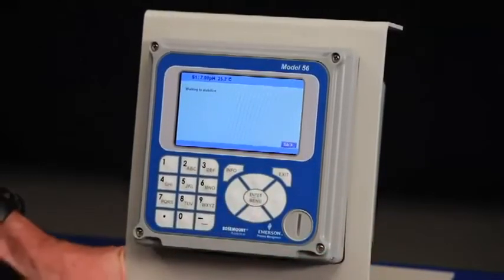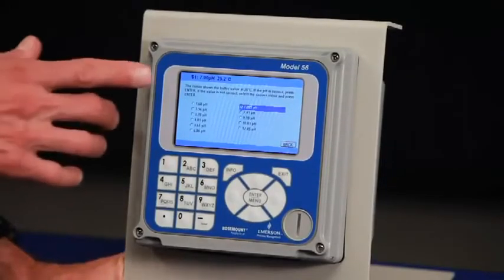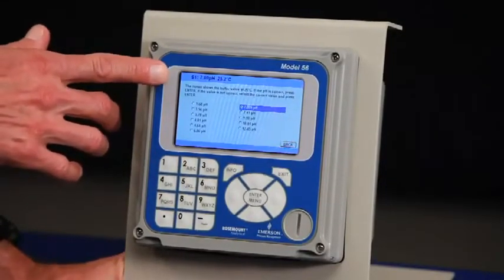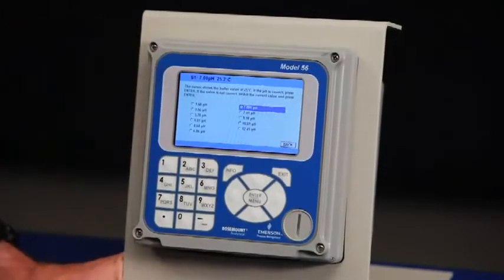Proceeding through the calibration by pressing enter will display the buffer values for buffer 1. And it's very important that the technician can see the live input value at the top of the screen to make sure that it's stable before calibrating.